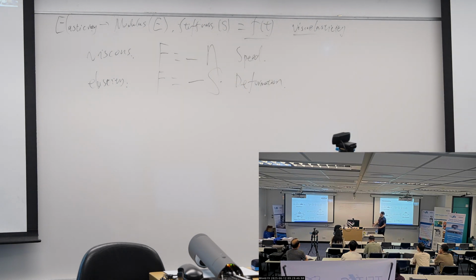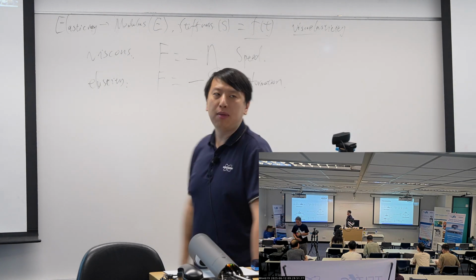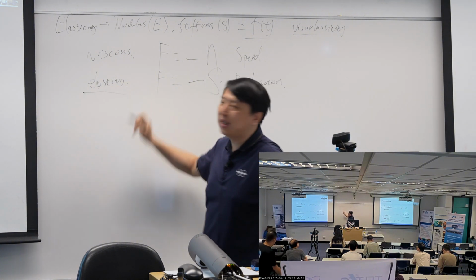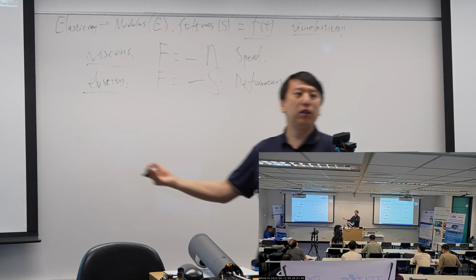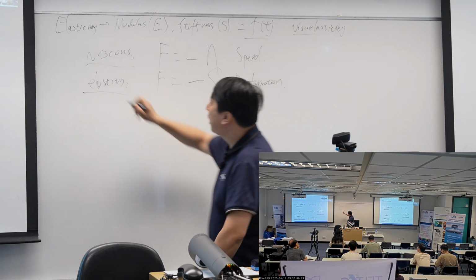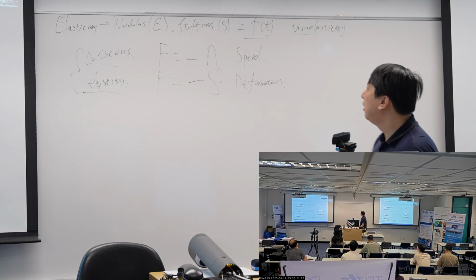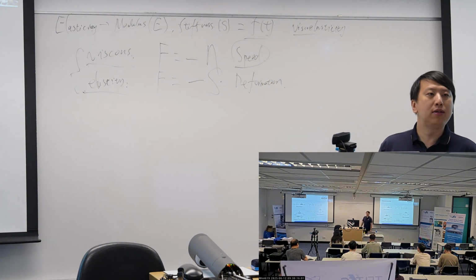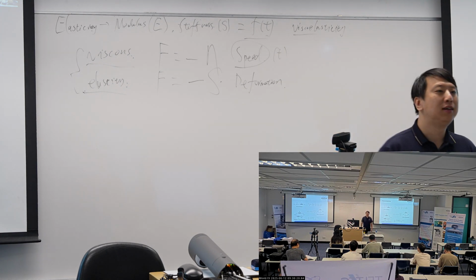For the real materials we face in daily life, especially polymers, many are not purely elastic. They show some viscous, or fluid-like, properties. So we combine them together and call it viscoelasticity. Since there is a speed, the viscoelastic relationship needs a time term.